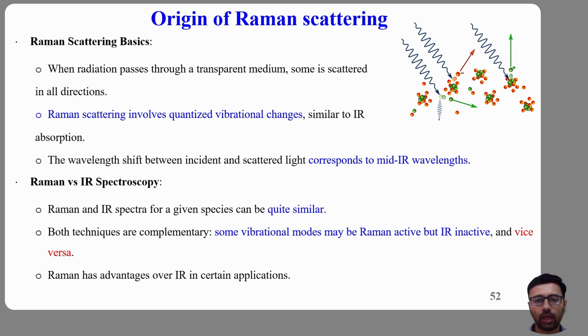But today we are going to explore a completely different interaction between light and matter. Today we move from absorption to scattering. Welcome to the fascinating world of Raman spectroscopy.